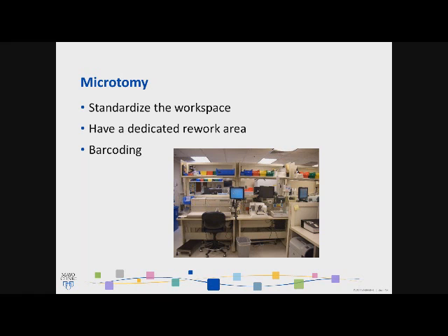We have everything supplied every morning so that there is no need to get up and sit back down. We have all of the slides available at the workspace. And we need to have a dedicated rework area. Rework is usually the most likely place for error. So in each space, we allow the technician to dedicate the rework area.